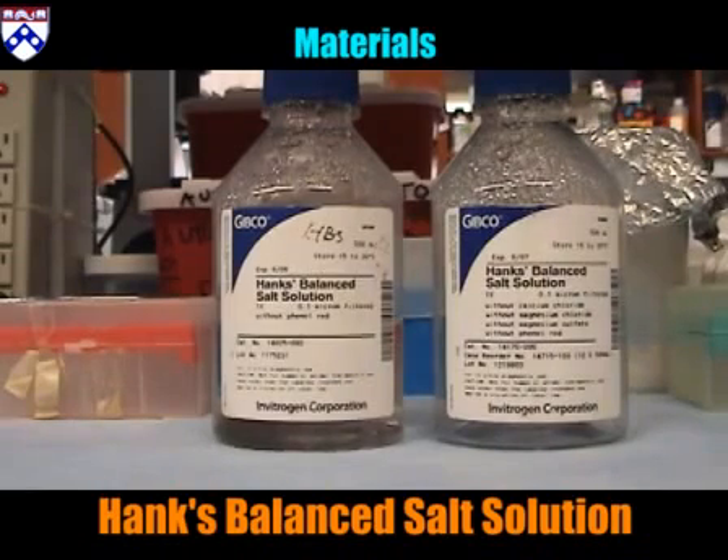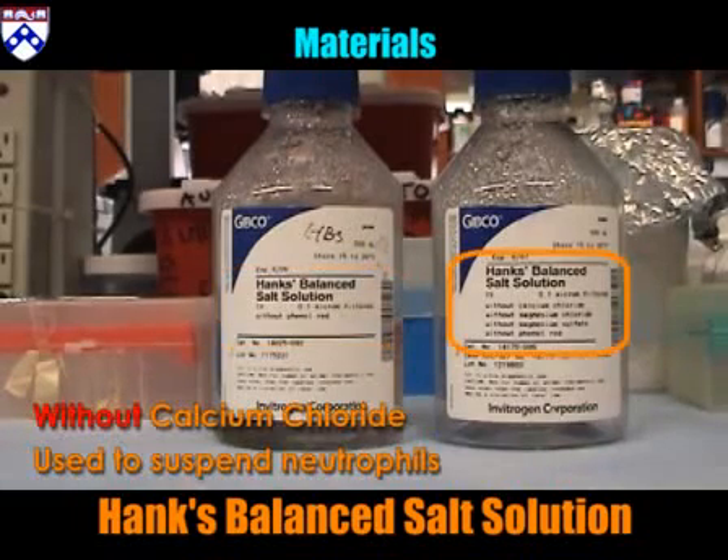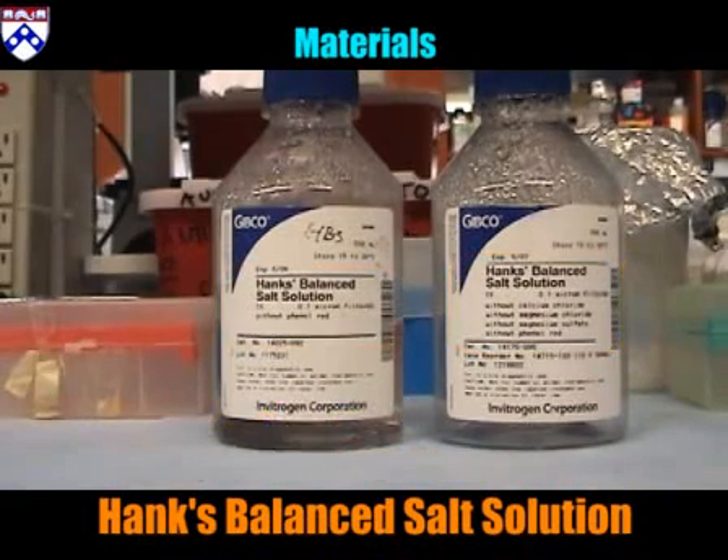Materials. Hanks' balanced salt solution: neutrophil separation requires two kinds of HBSS solutions. HBSS with calcium chloride will be used to make a solution with human serum albumin. HBSS without calcium chloride will be used to suspend and wash the neutrophils. Please take special care to use the appropriate HBSS solution in this procedure.